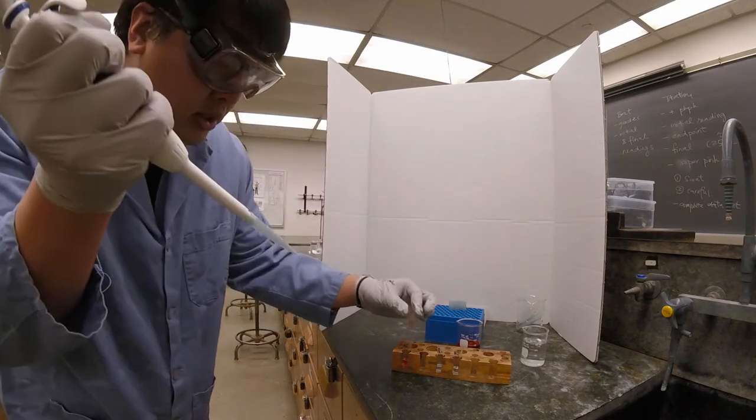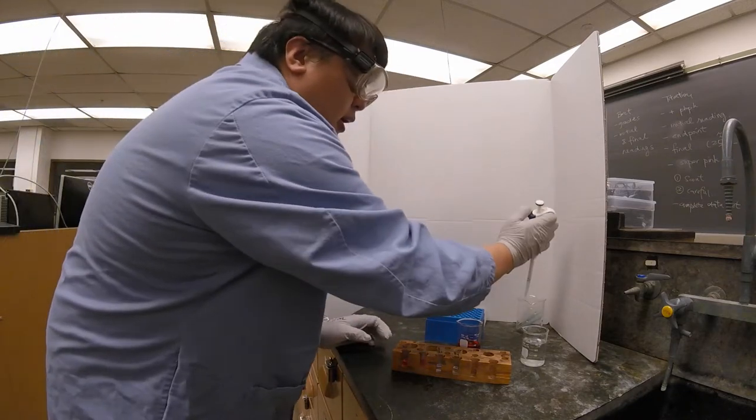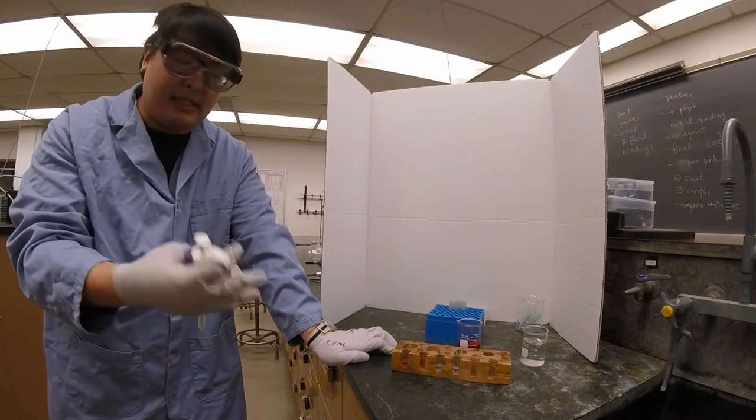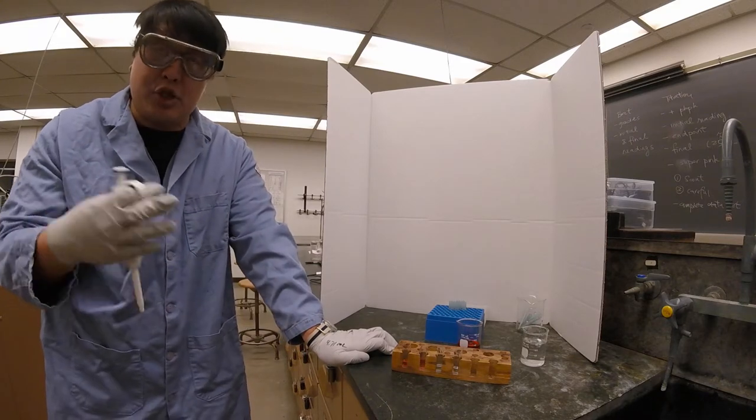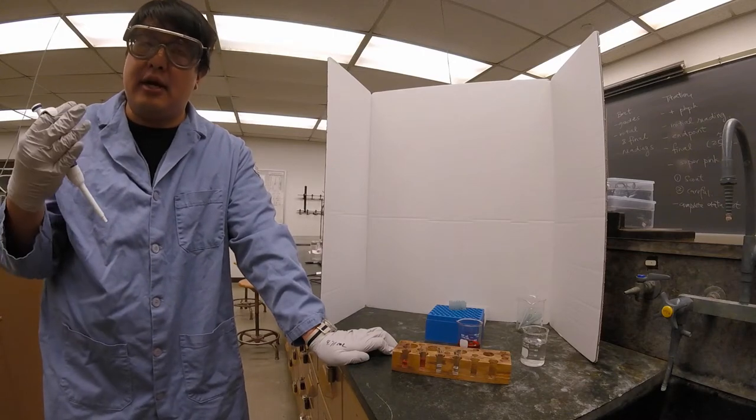And I'm going to now eject the tip and I'm going to do the rest but I'm not going to have any commentary behind it because it's the same process as I've done for the first two and at the end I'll show you how the colors change as you continually dilute the solution.